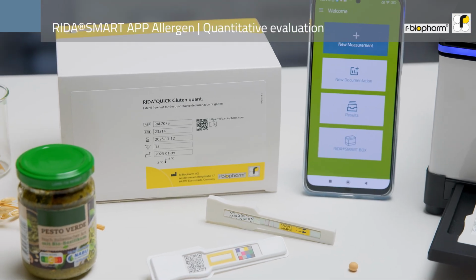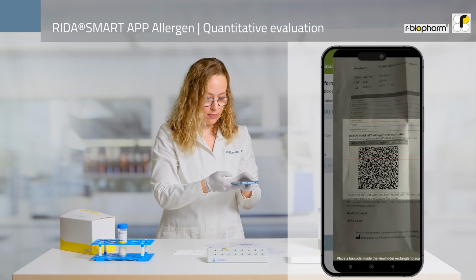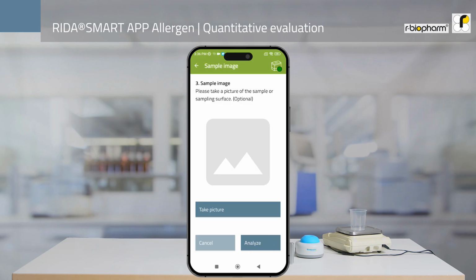In the second step, enter the lot information for the test kit by scanning the certificate of analysis or by selecting the information that has already been scanned. Then select the application. In this example, a food sample is analyzed. Please note that different applications have different limits of detection and limits of quantification. Third, take a photo of the sample for more detailed documentation. This is optional.